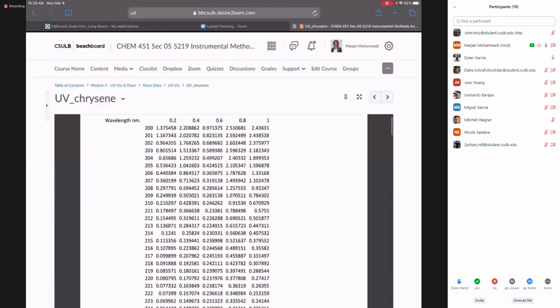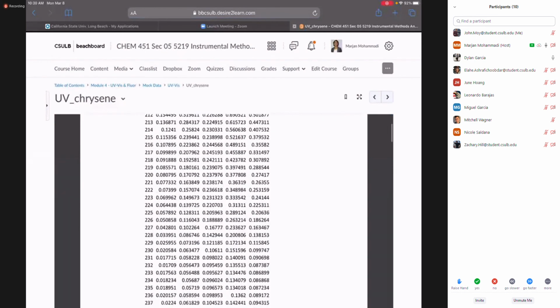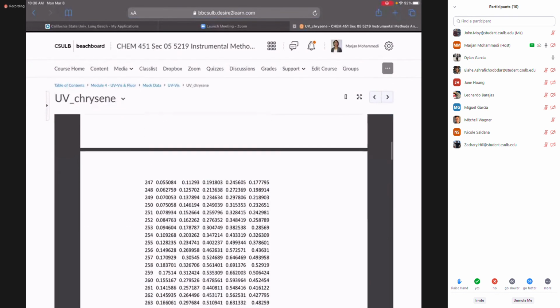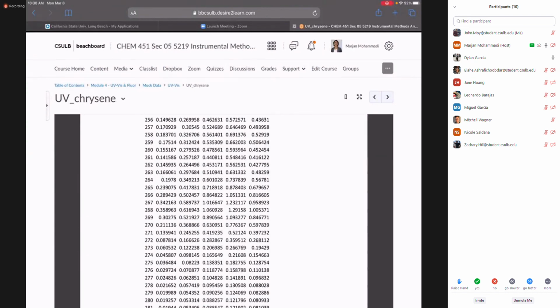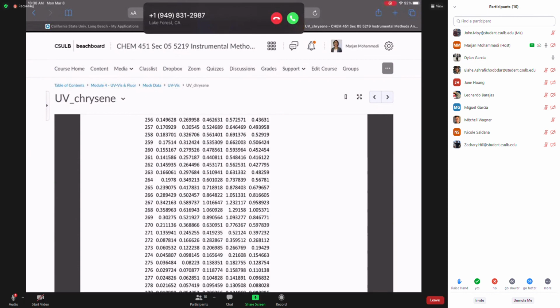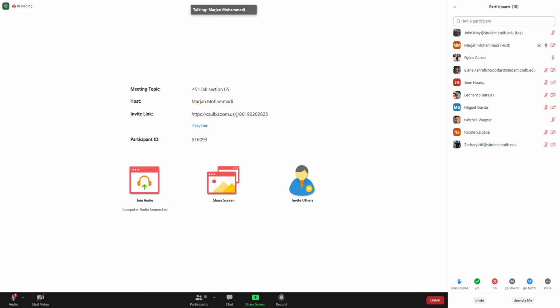See, guys, you can just take those data and make a graph, and it's already giving you the overlay for all concentrations. Take a look right here, at 268. Let me share the screen again one more time with you.